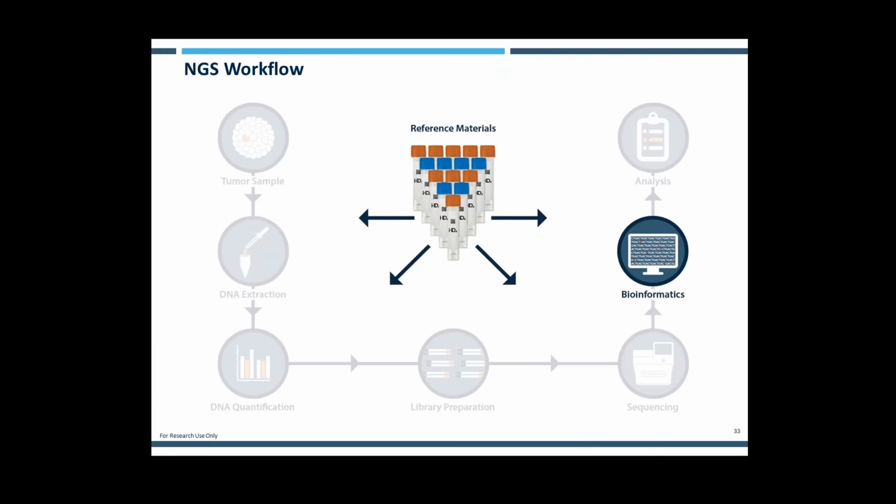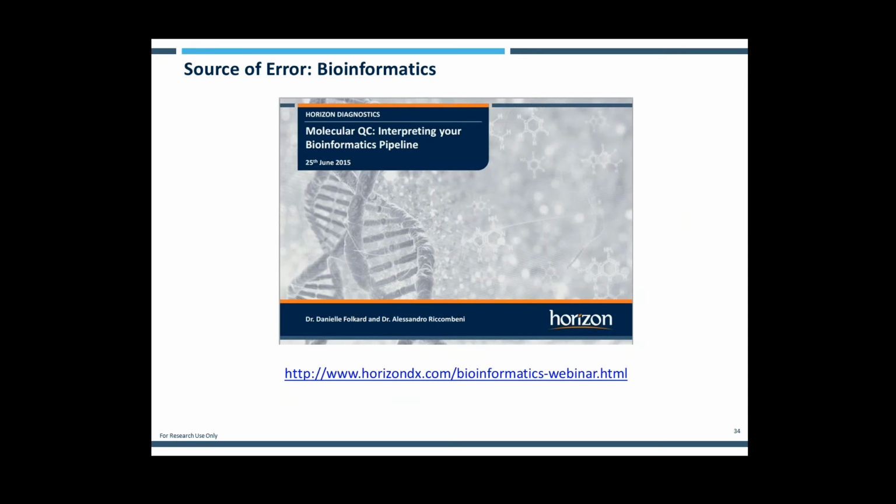And so to wrap up the NGS workflow, I wanted to briefly mention again the role that bioinformatics analysis can play in introducing variability. I would recommend checking out, under scientific support, our archived webinars, where you'll find our bioinformatics webinar that was held last month. So that's where you'll find it.